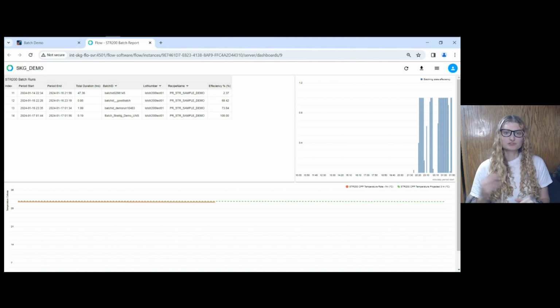However, if your total efficiency is 75%, that one number doesn't give you the full picture. Batches normally take days, so if you pair it with a minutely graphic, you actually get a better sense of how it went. Was it a constant struggle so efficiency hung around 75%? Or was it going great and then something happened at 3 a.m. so it dropped and then it came back up? Knowing which scenario it was enables your shift leaders, managers, engineers, whoever, to pinpoint where to start an investigation.